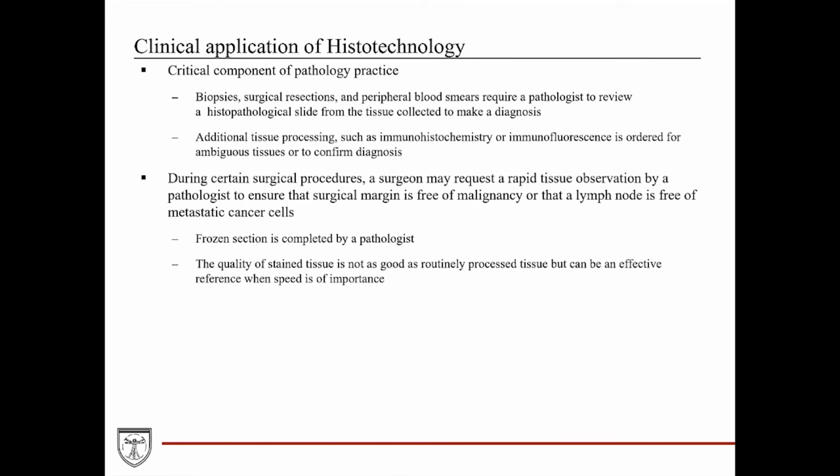The quality of the frozen sectioned tissue is not quite as good as the routinely processed paraffin sectioned tissues, but when speed is of essence, frozen section can be quite informative. And this type of procedure is commonly used by surgical oncologists and dermatologists who specialize in Mohs surgery.